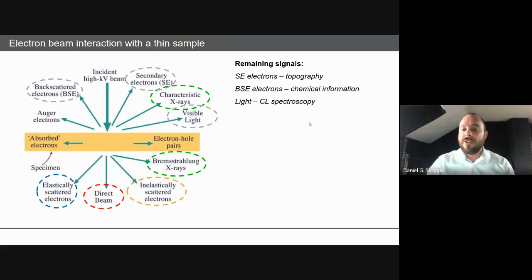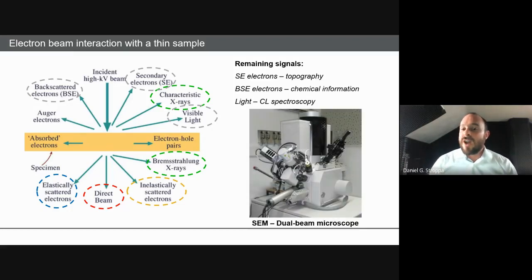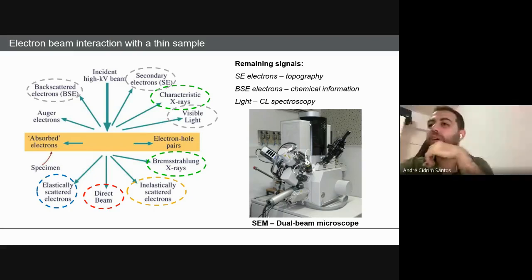So typically, Daniel, regarding space constraints, the samples, usually do you have to make a special treatment? Okay, there must be a limit in the size of the samples, but if you have an amorphous sample, is it really much worse than using a crystalline kind of structure? I know that the things that will be emitted will be very different, but how constrained are you in the sample's structure?